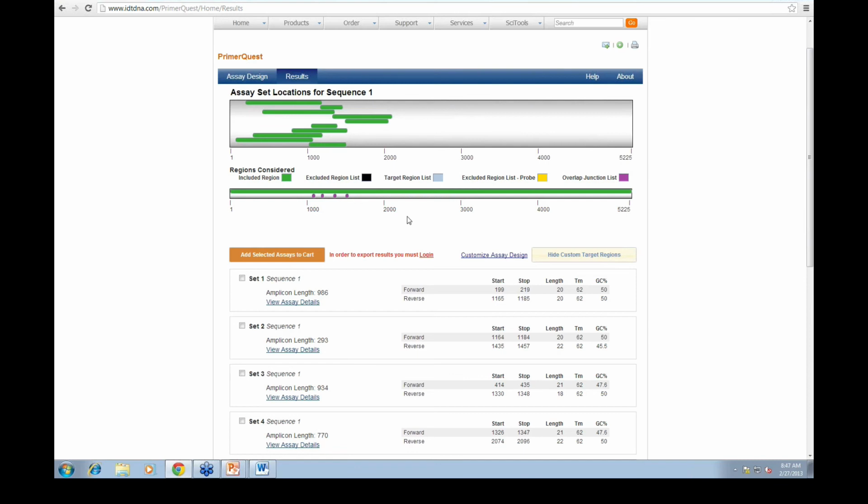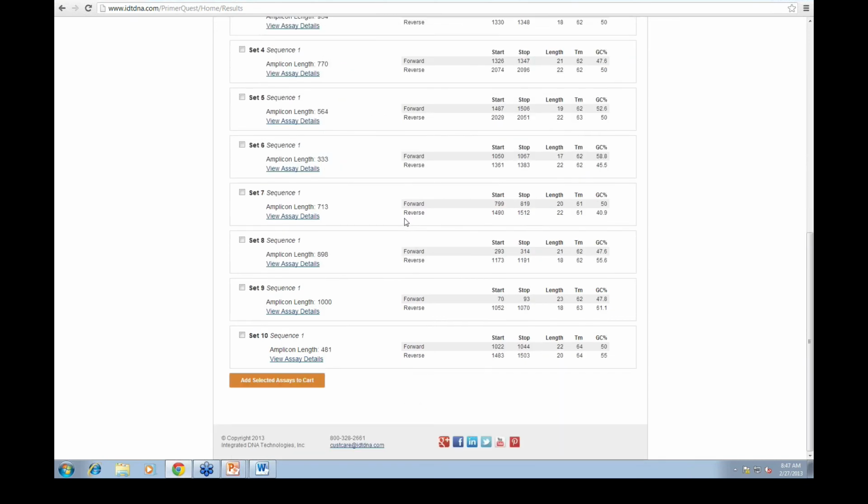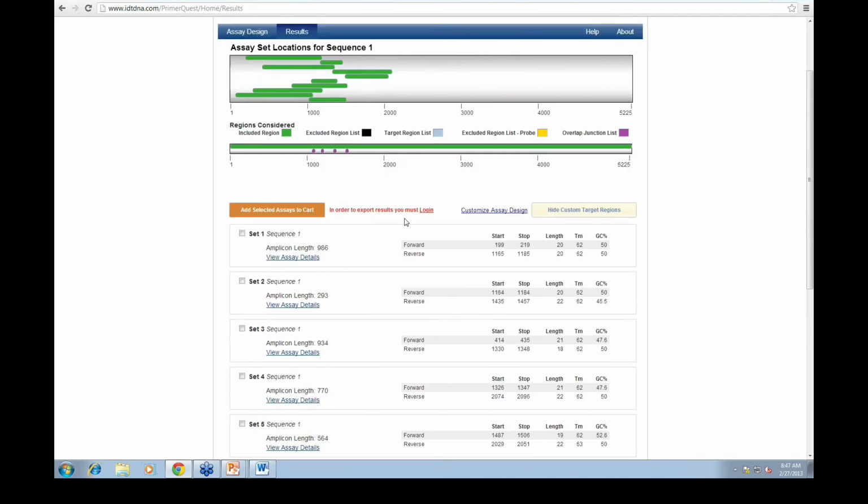I'm not sure about the target sequence. I'm not sure exactly what that question is asking. Typically, we're more concerned about the primers laying down on that target sequence. And usually, based on the parameters that we specify, having a GC content of 50%, something around there, it usually does get it in regions that don't have a lot of secondary structure. Typically, those regions that have the most secondary structure are a little bit more GC rich. So I don't think it takes that into account for the amplicon region or the target region. I can take a look into that a little bit further.